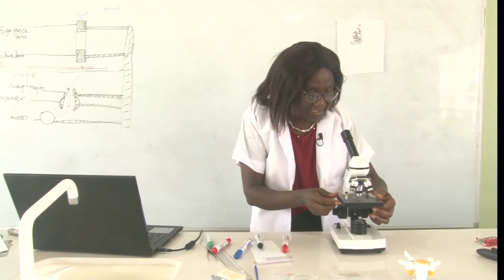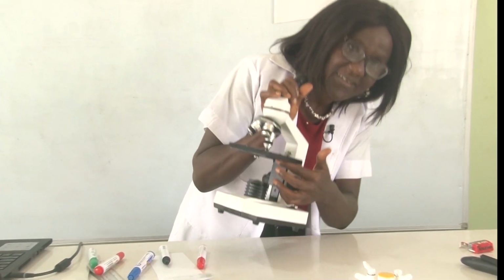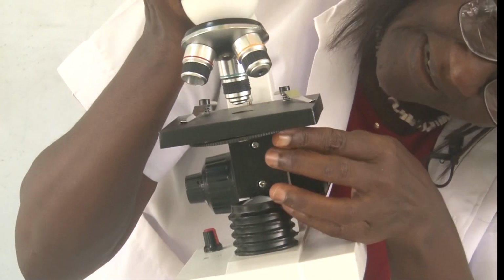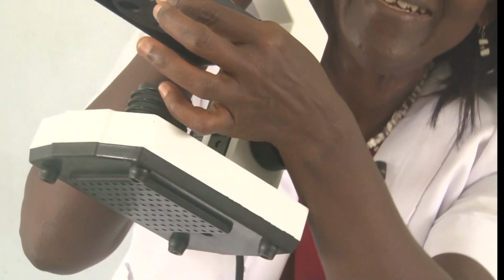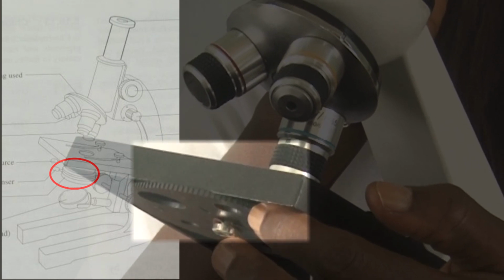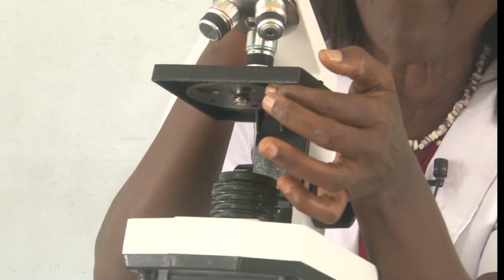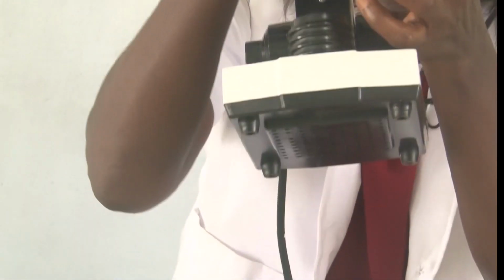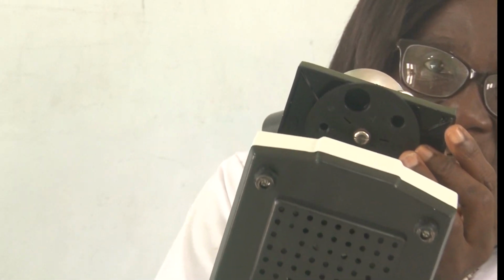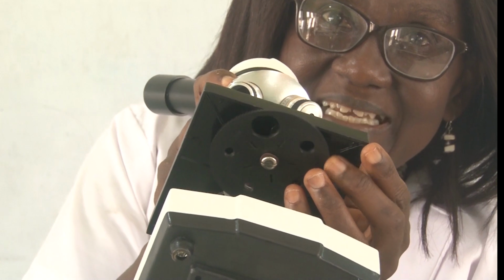The condenser is here, under here. And this condenser is also built in with a diaphragm. You see that there are holes in there, so you can increase or decrease the amount of light getting through.